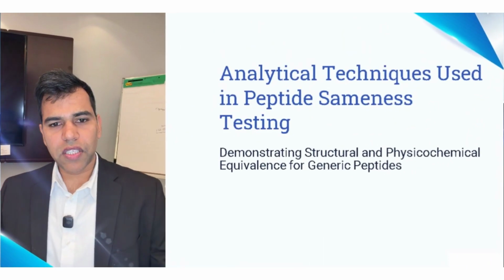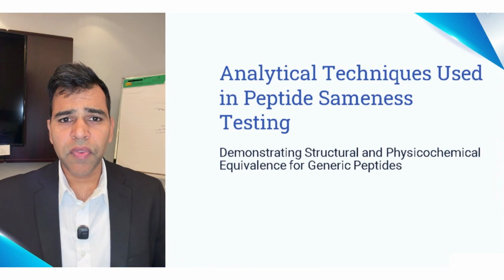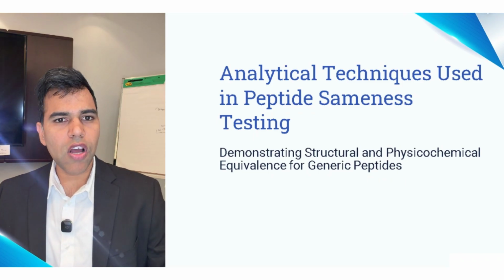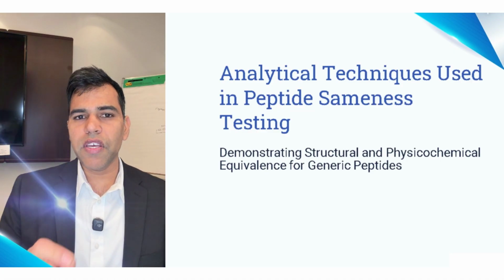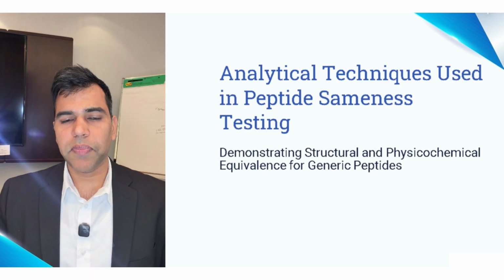Here is a question that doesn't get asked enough in the pharma industry. How do you prove that your peptide is the same as the innovator's? Not just similar, not just bioequivalent, but actually the same. Because if you get that wrong, the FDA will tell you, and that conversation is expensive.